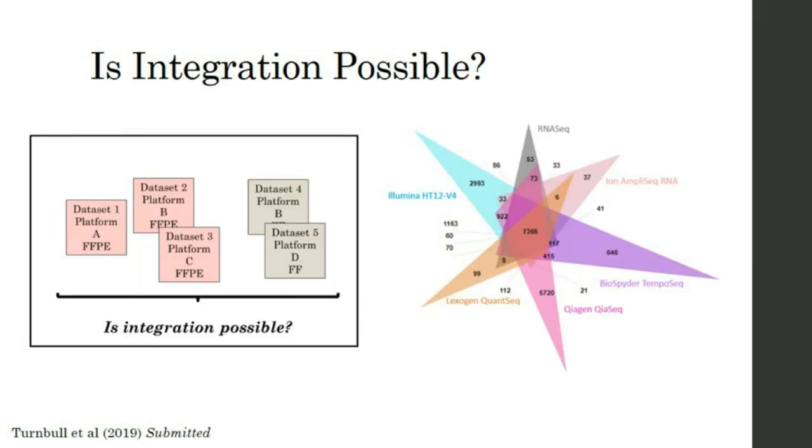So our question really was, if we can generate reliable data from these different studies, can we integrate that? Can we integrate fresh frozen Illumina data with Lexogen QuantSeq FFPE data? That was our real question here.